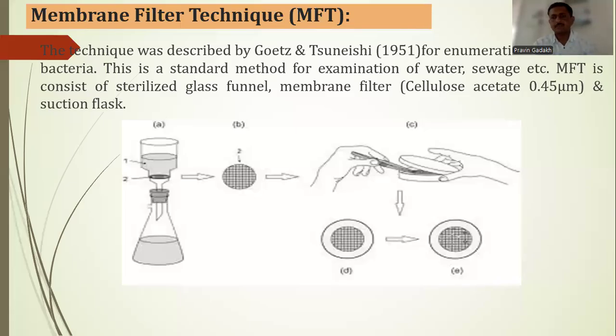Hello, dear students. The next technique used for determining the bacteriological quality of water is the membrane filter technique, or MFT. We can also say MFC, membrane filter count, or membrane filter technique. This method was developed by Germany during the Second World War for enumerating coliform bacteria in water and has been accepted as a standard method for coliform organisms.